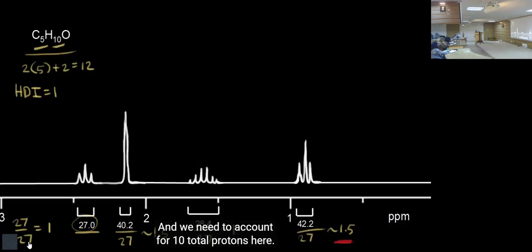And when chiral centers are present, each proton behaves differently and its magnetic environment becomes different. So you can easily identify at least one proton that must be there, most often in natural products.